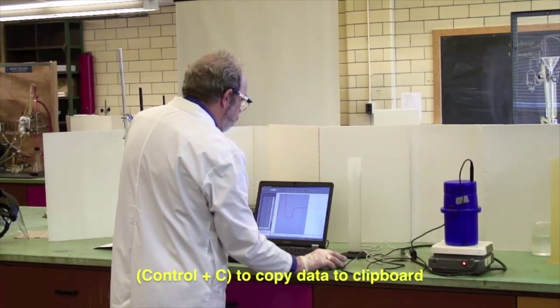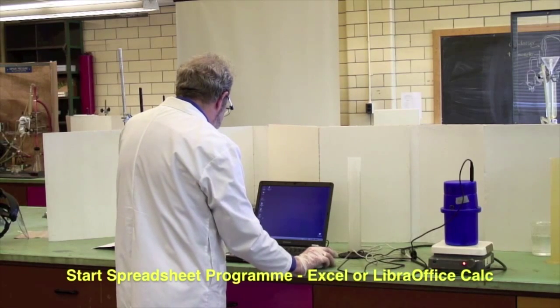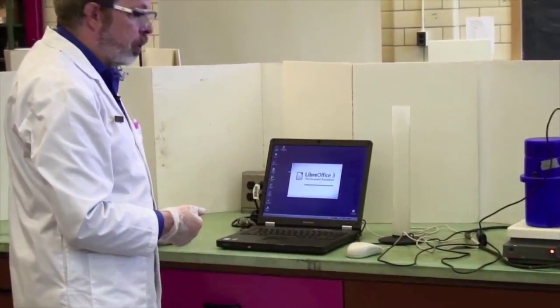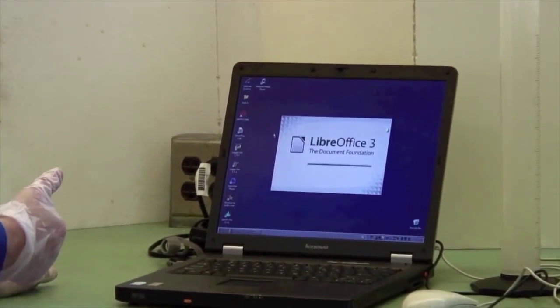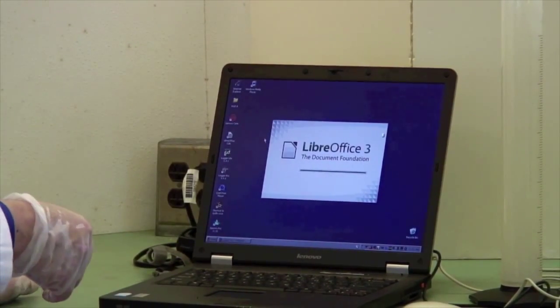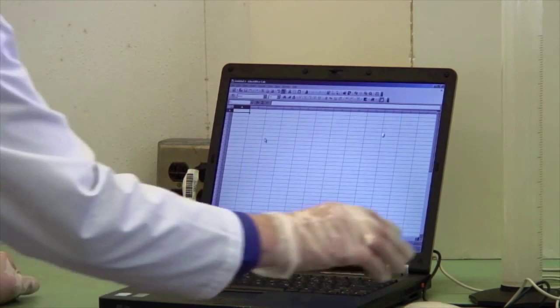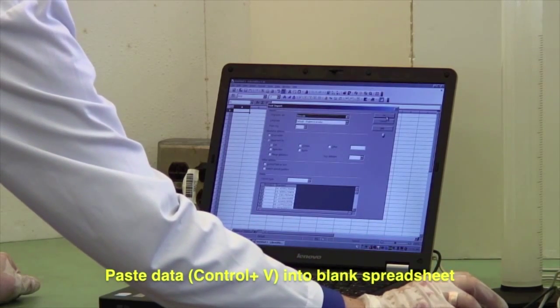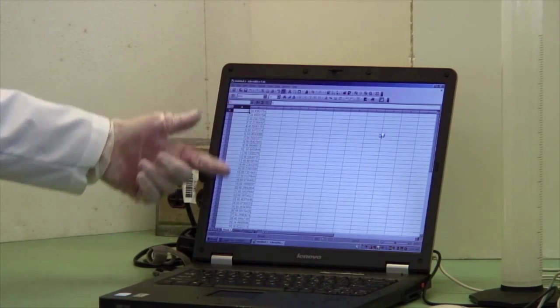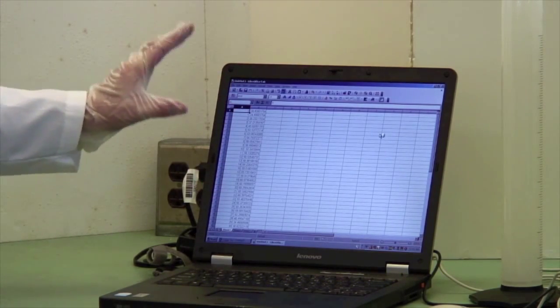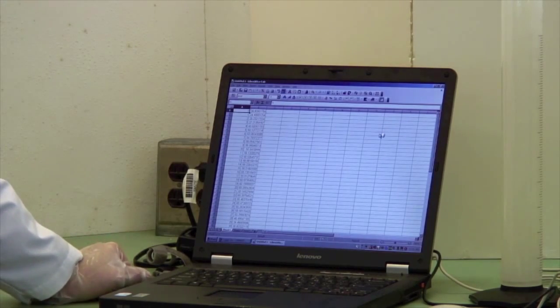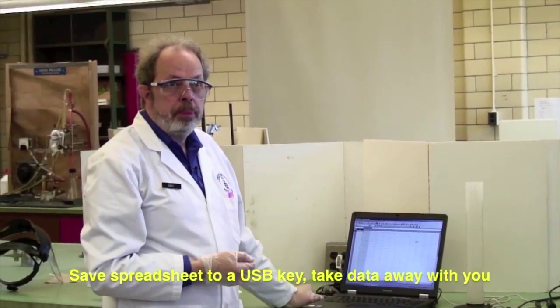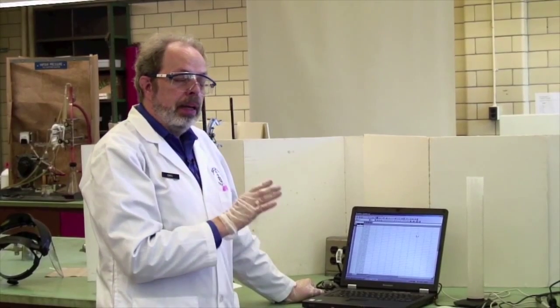And at this point, you want a spreadsheet program. This particular program calls it LibreOffice Calc. You may have a computer that has Excel on it. But fire up a spreadsheet and just cut and paste the material. Control-V. And there we have temperature as a function of time. And you can save this and eventually export it into a USB key that you can then take home and crunch the numbers with. So that's it for calibrating the calorimeter.